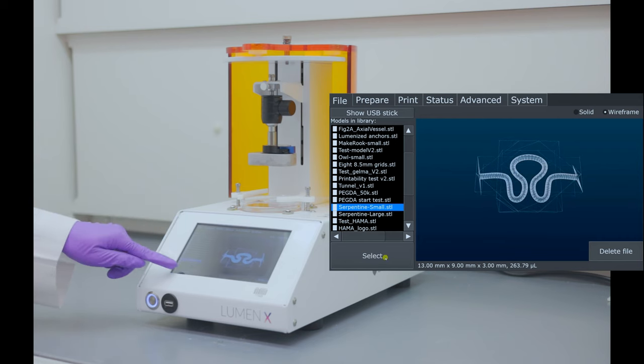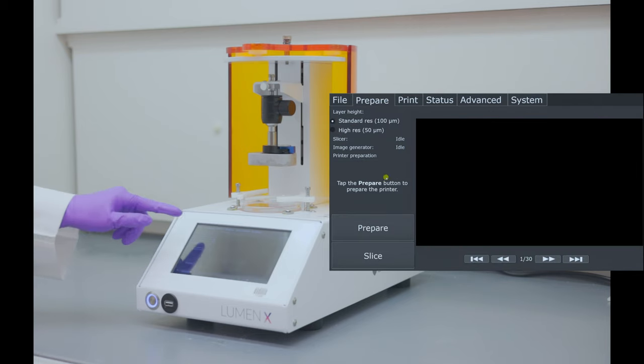After confirming the file, tap continue. Next, we go to the prepare menu. Here, we can choose a resolution between 100 or 50 microns, which determines the Z resolution. Now, we can tap on slice.